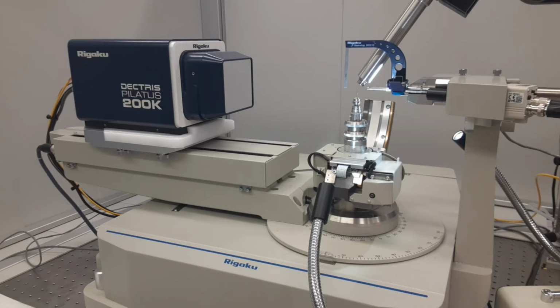So the actual face of the detector is fairly small. There are much larger ones available, the 2M and the 3M, which have 2 and 3 million pixels respectively. Those are extremely expensive and are normally only seen at government synchrotron sites. However, even though ours is a smaller size, it's perfectly acceptable to use with a little creativity with the associated AFC11 4-axis goniometer. So the 4-axis goniometer means it can rotate the sample in 4 directions.